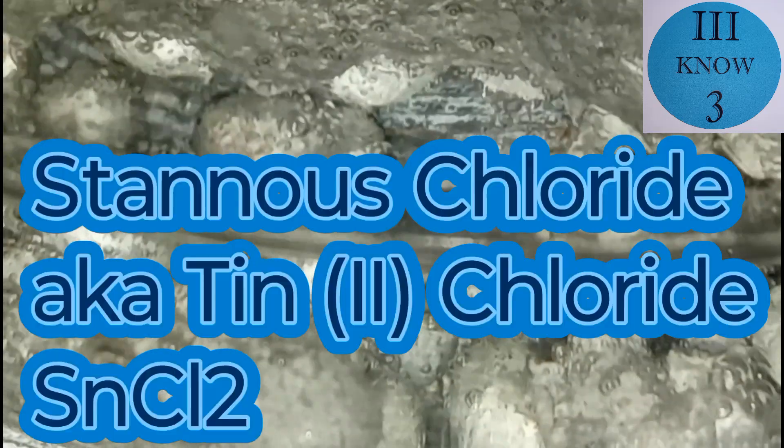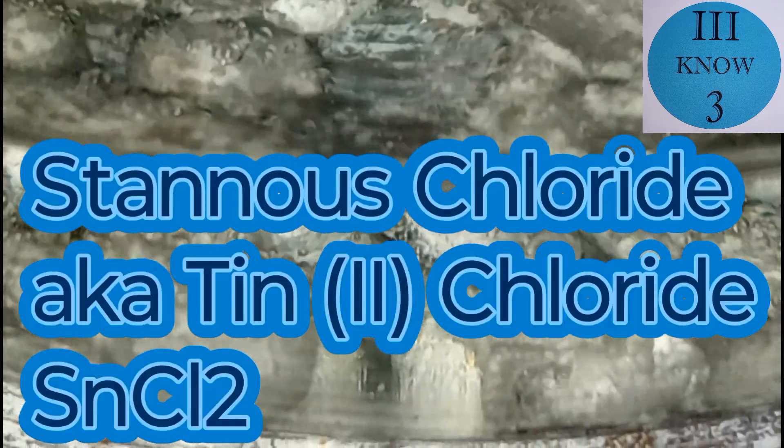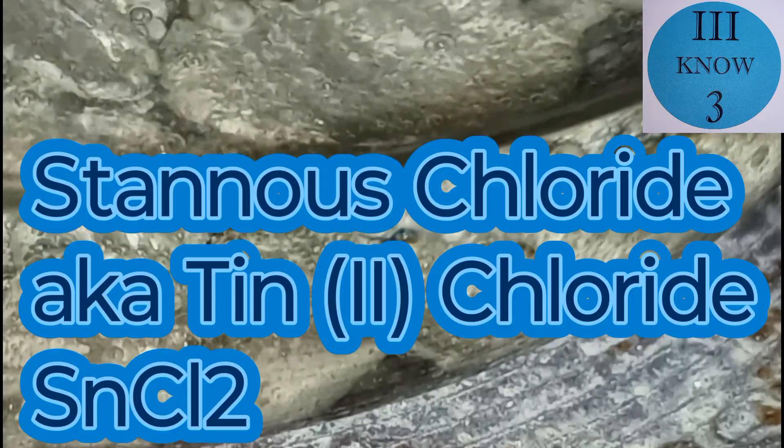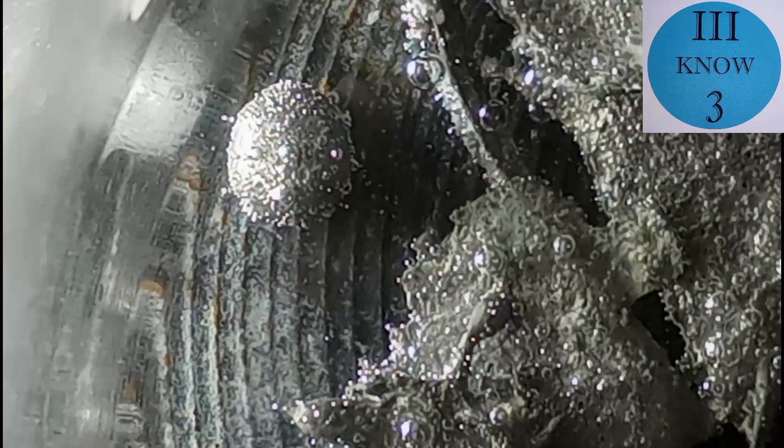The goal of this part is to make stannous chloride or SnCl2. So at this point it looks like there's a pretty good reaction starting. Now I've made stannous chloride before when I wanted to use it to test gold solution, but for that I only needed about 5 grams of tin and I could let it sit for a few days to get completely dissolved into the hydrochloric acid.